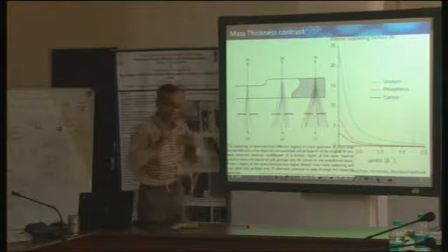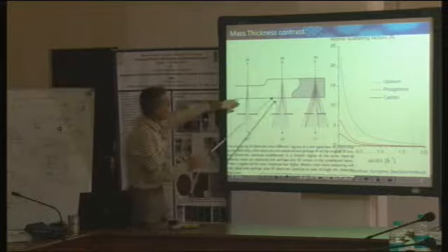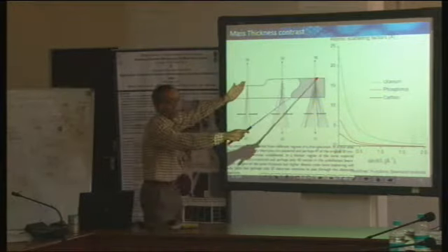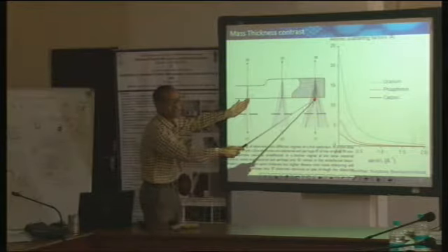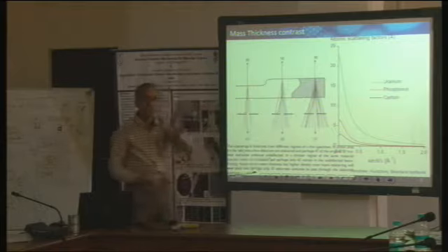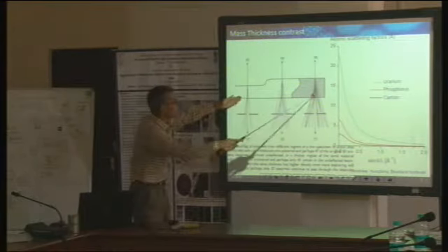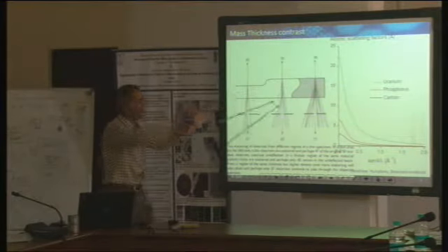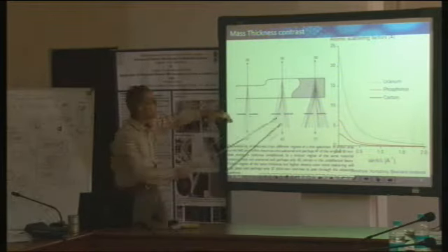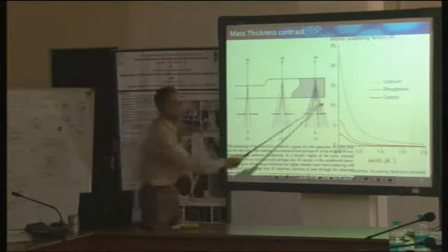Let me try to make it a little more elaborate. A parallel beam falls like this. Then what will happen at this stage? The parallel beam will continue to go down. One diffracted direction will go something like this, and the other diffracted direction will go something like this. Correct? That's what happens. Then I put an objective aperture here.